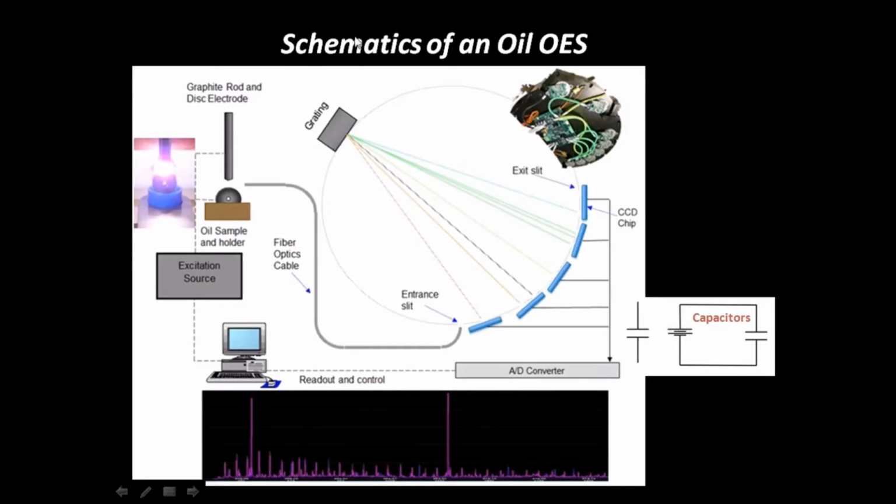The entire process takes up to 45 seconds, and the processing time depends upon the wear metal size. Concentrations of wear metals in the level of ppm are obtained. A rotating disc type oil spectrometer cannot identify wear metals of size larger than 10 micrometers, a drawback which is being addressed in ICP type or inductively coupled plasma type rotating disc electrode spectrometers.